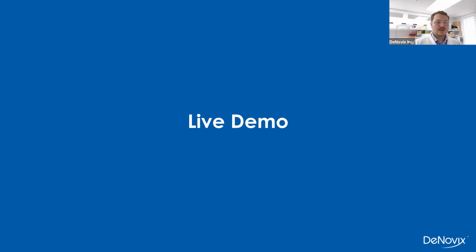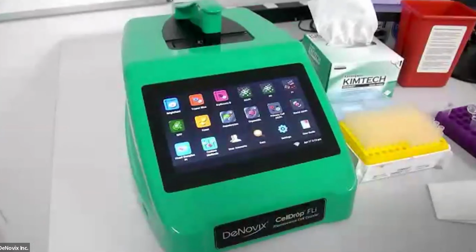Wonderful. Thanks. So now I'm going to be switching to a live demo. I'm going to be using the CellDrop FLi, or the fly, as we like to call it. We'll be doing 3 counts today. First one is going to be Jurkats with trypan blue. Then I'm going to switch to fluorescence counting. The second count is going to be Jurkats with AOPI, and then primary PBMC samples with AOPI.